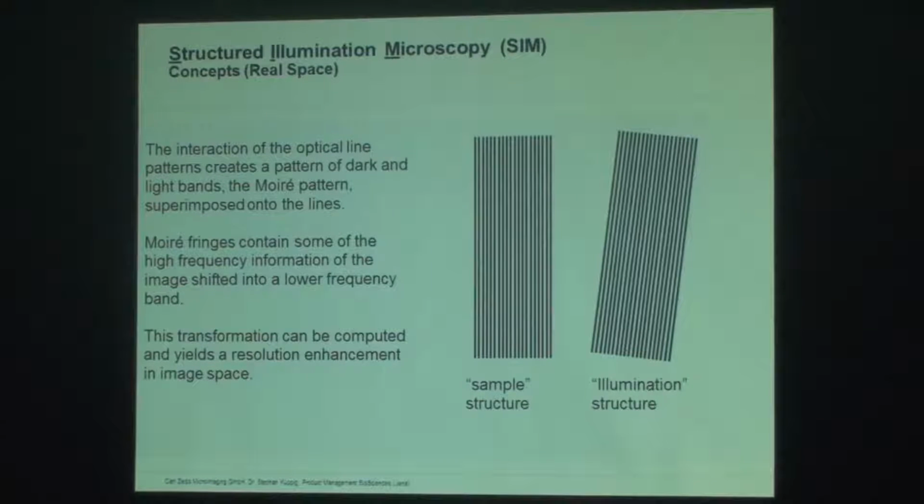Okay, how do you transfer the high bandwidth or high frequency information into a low bandwidth optics? That's the fundamental principle of this structured illumination.